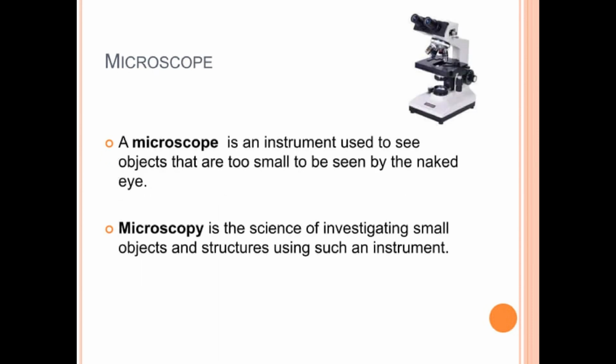What is a microscope? A microscope is an optical device used to magnify and visualize tiny structures like cells in a tissue sample. In histopathology, the microscope is the final and most important tool for diagnosing diseases. How it works: light passes through a thin tissue section, and the microscope magnifies the image so the pathologist can study the cellular details. Purpose: microscopes allow histopathologists to identify abnormal cell shapes, structures, or patterns that could indicate disease. Think of the microscope as a magnifying glass for the body, enabling us to see what the naked eye cannot.